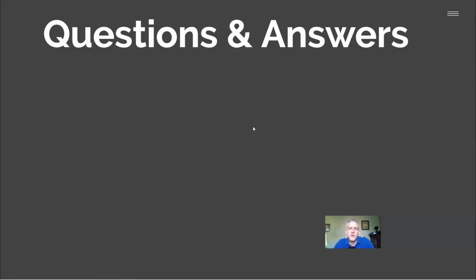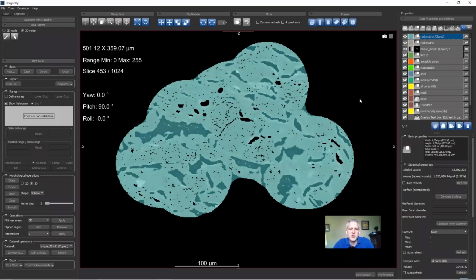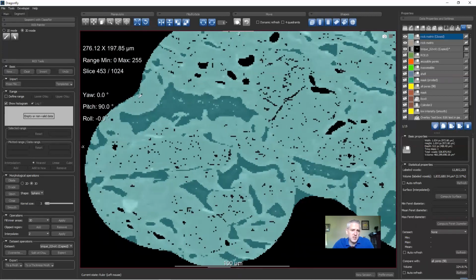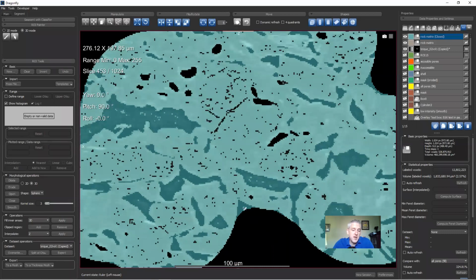Next question, how would you refine your shrink wrap? What are the tools you would use to close the holes you noted? Well, no, I don't think I have an answer for how would you close these holes. The shrink wrap is not perfect. And that's what I think you see here, is that the shrink wrap gets this and it gets this, and you have to decide, is this a real pore? Is this a real pore? This is clearly a real pore. You could, in fact, take the difference between the shrink wrap and what you had before, and then take all of those and sort them by size and say, if they're just 1 or 2 pixels on the surface, maybe I don't want to treat it as a real pore and as an artifact. That would get rid of those. And then maybe you could manually prune these.